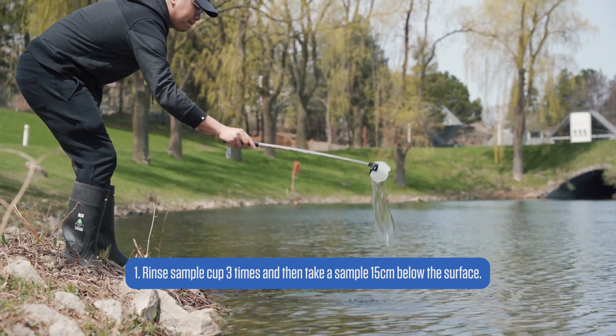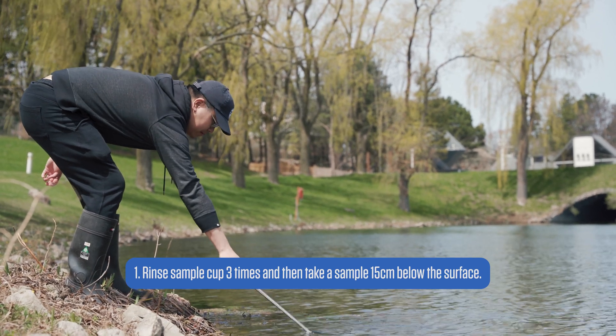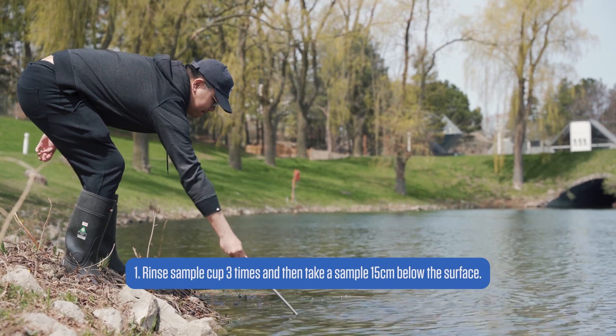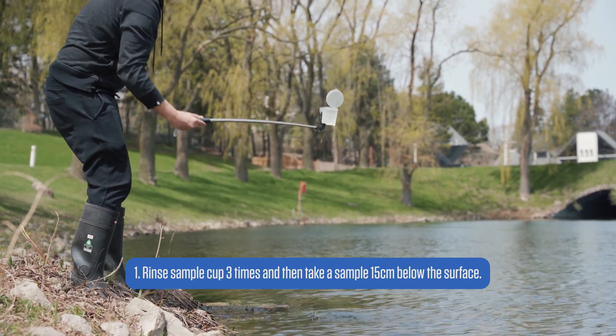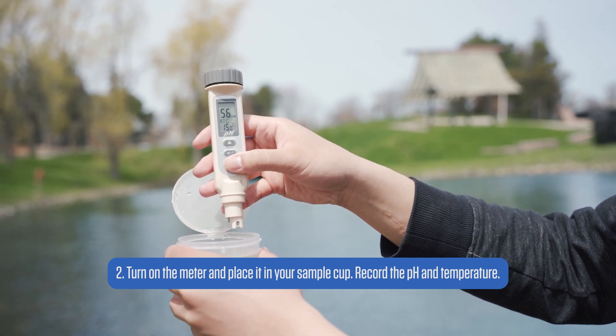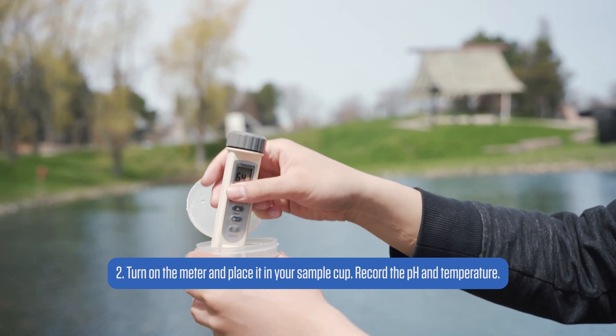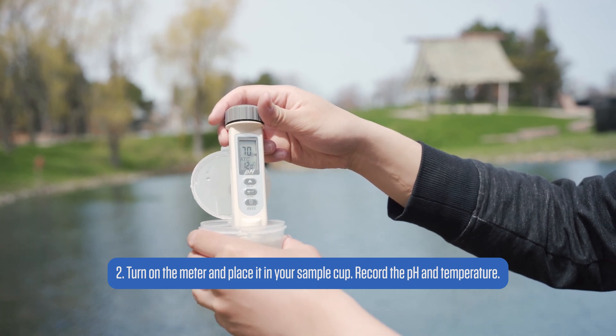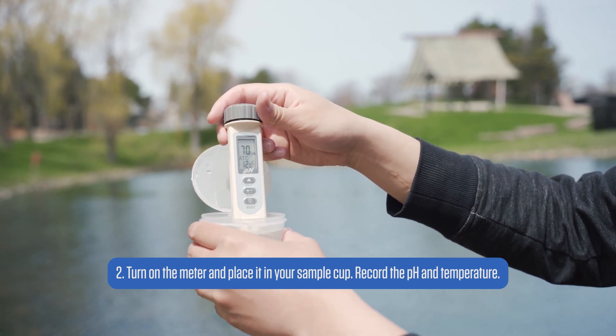To take a measurement, let's first get a water sample. Make sure to rinse the sample cup three times before taking the sample. Then simply dip the meter into the water and wait for the number to appear on the screen, and wait for it to stabilize before recording the number. You can even press the HLD or hold button to freeze the reading so you can take notes without it changing.